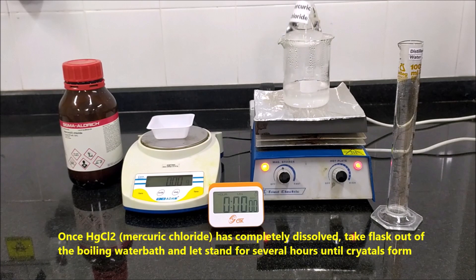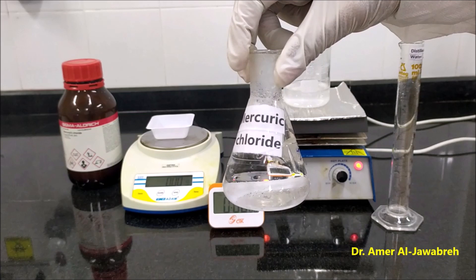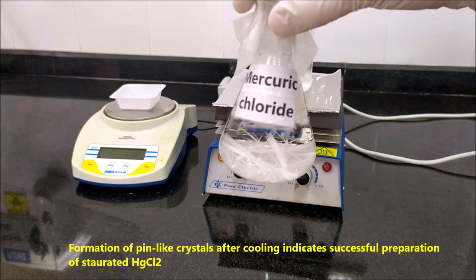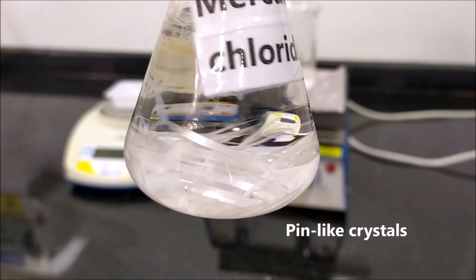Once HgCl2 has completely dissolved, take the flask out of the boiling water bath and let it stand for several hours until crystals form. Formation of pin-like crystals after cooling indicates successful preparation of saturated HgCl2.